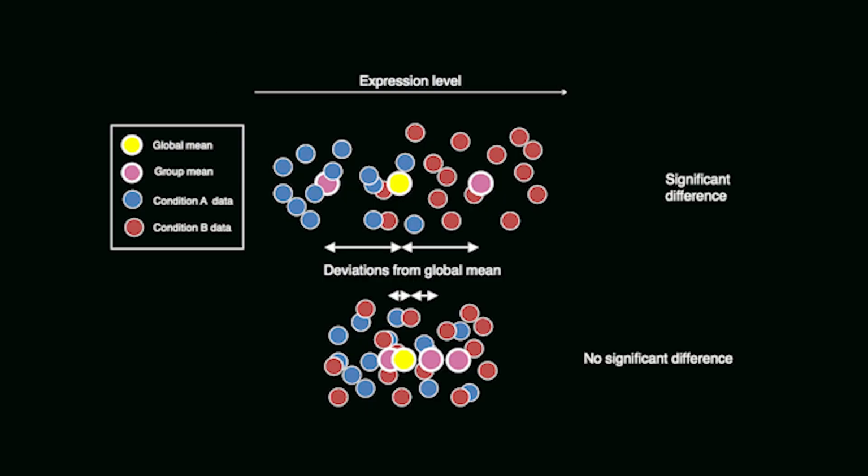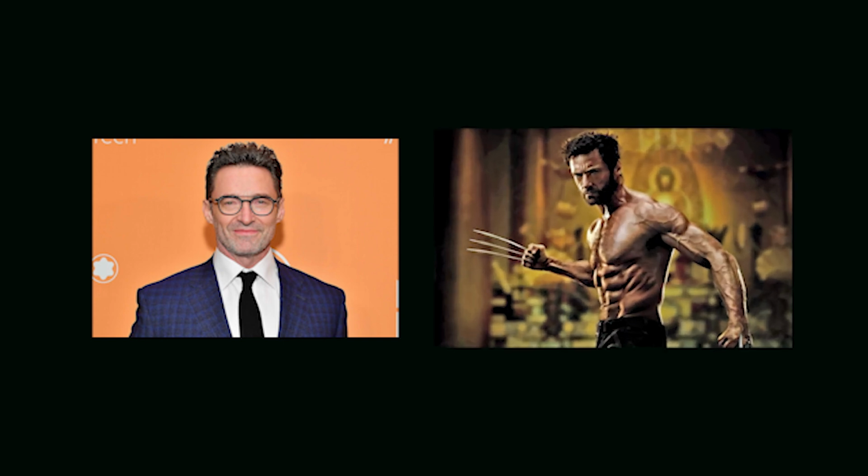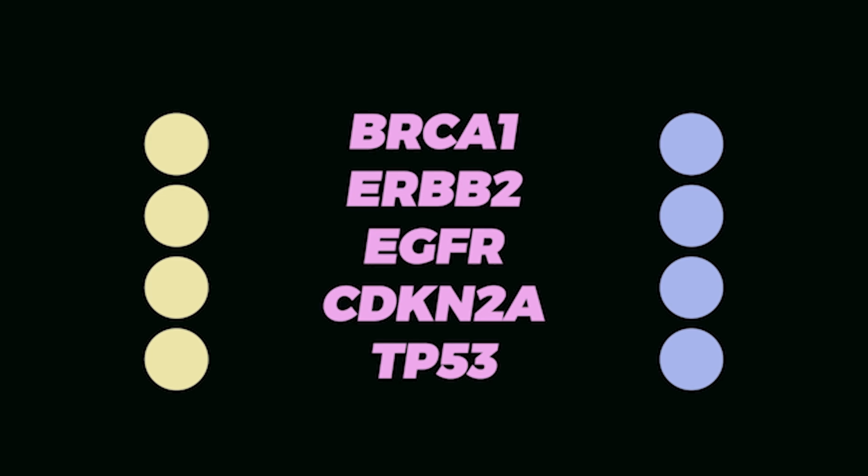Thus, we have a relatively simple method which is generalizable to a family of biomolecules that can be used to understand biology. For example, differential expression analyses identify up or down-regulated transcripts between two groups. These groups can be stratified along different variables. A common one would be a wild-type or mutated version of a particular gene. Gene expression can also be used as a feature rather than an endpoint. Splitting patients according to the expression of a single gene is commonly done. You can also use multiple genes, which is the concept of a gene expression signature.